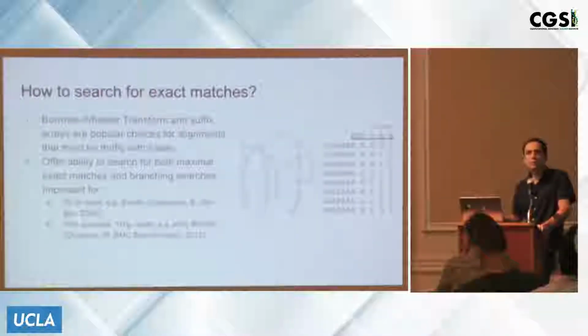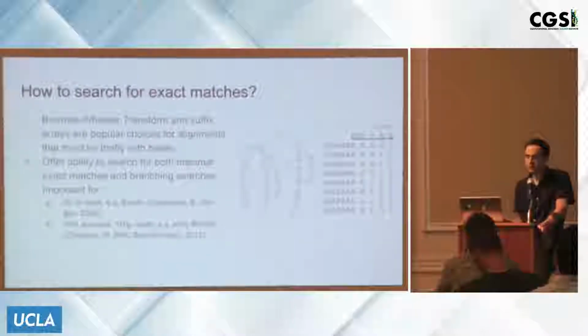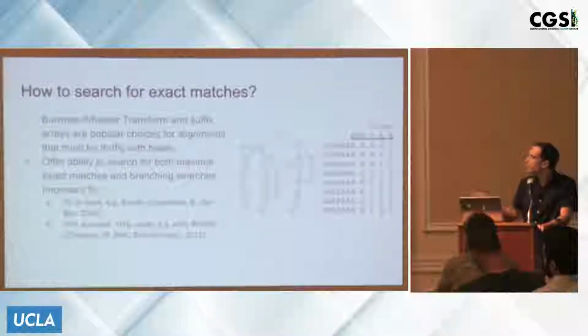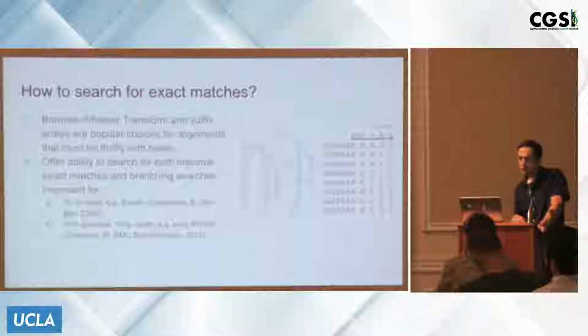And the reason for this is that you don't want to have any fixed length word that you're hashing on, because you're not guaranteed with any particular sequence that it'll have any of those fixed length words to align. Not only that, but for very short sequences, say the 32 base pair reads that the very first Burrows-Wheeler aligner was based on, you'd like to do some sort of threading where, with a 32 base read, you might not have any very long matches, and so you'd like to try different alternative sequences that can potentially match back to the reference.